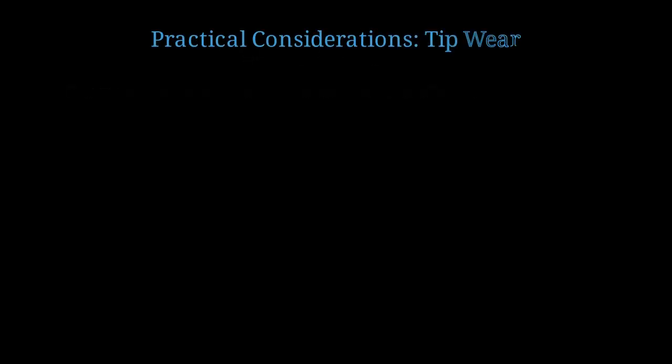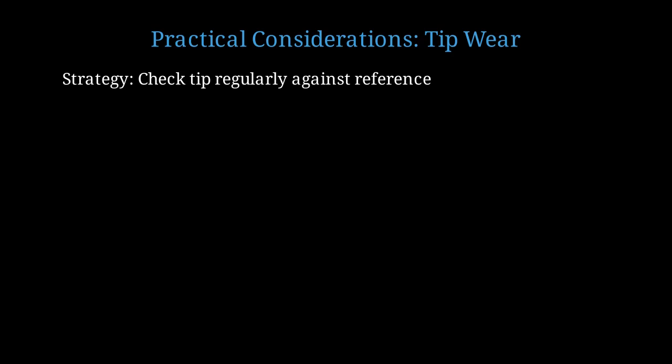Speaking of tip wear, this is a major practical concern. Each indentation can potentially damage the tip, blunting it and increasing the effective radius. The strategy is to regularly check your tip by measuring a reference sample with known properties. If the extracted modulus starts to drift, your tip is likely changing. Replace it. Operate at the lowest force that still gives you good signal-to-noise ratio. There's a trade-off between large indentation for good signal versus minimal tip damage.